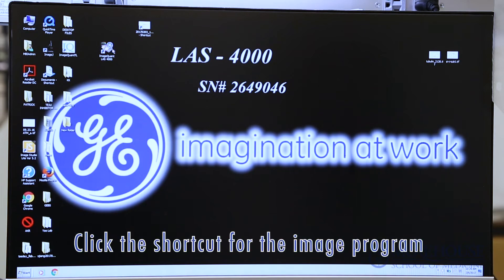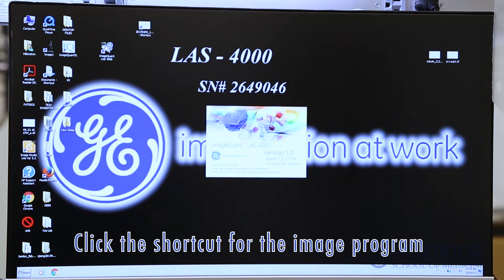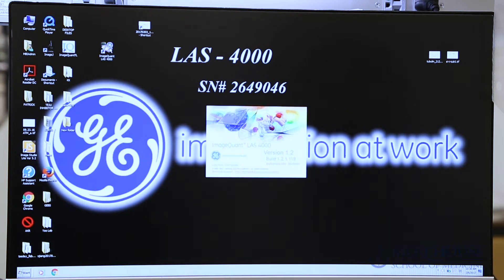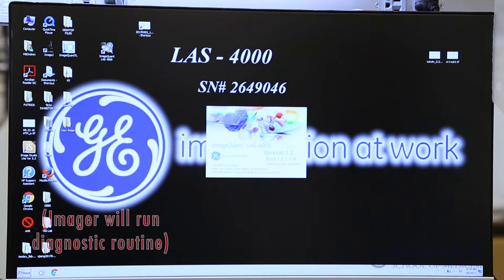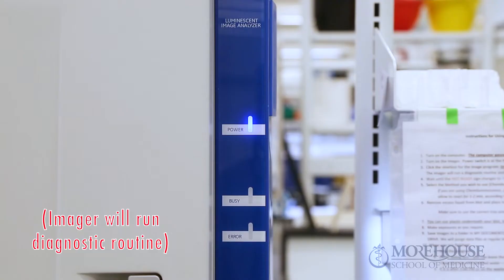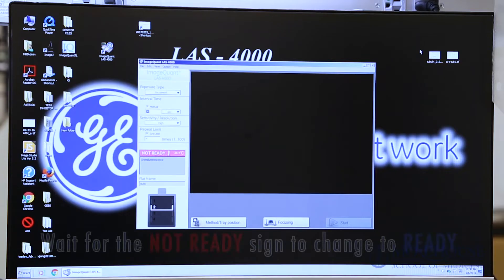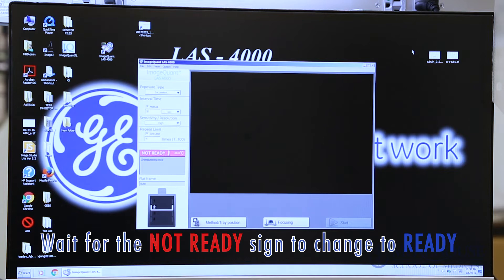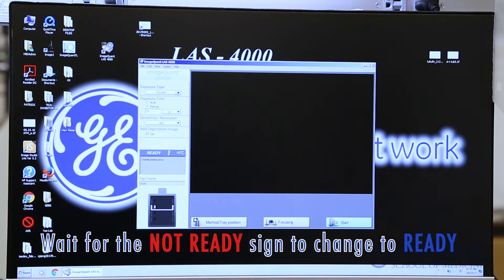Click the shortcut for the image program, ImageQuant LAS4000. The Imager will run a diagnostic routine and cool the CCD camera to minus 30 degrees C. Wait until the not ready sign changes to ready.